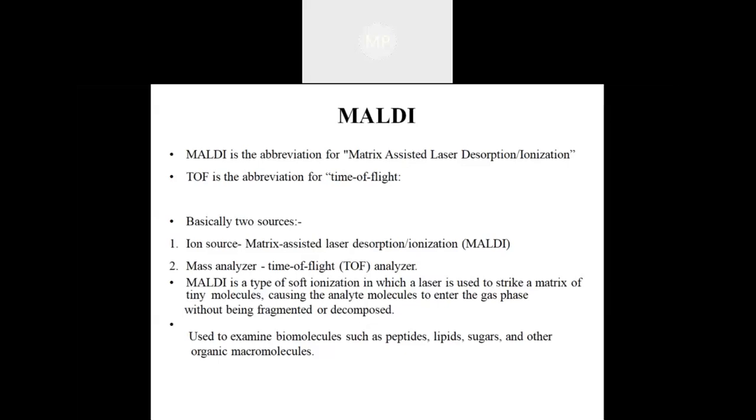So basically, it is a type of soft ionization in which a laser is used to strike a matrix of tiny molecules, causing the analyte molecules to enter the gas phase without being fragmented or decomposed. MALDI can be used to examine biomolecules such as peptides, lipids, sugars, and other organic macromolecules.